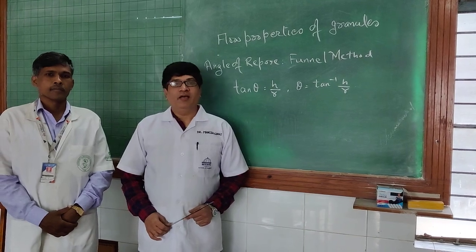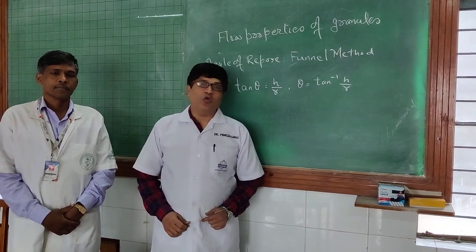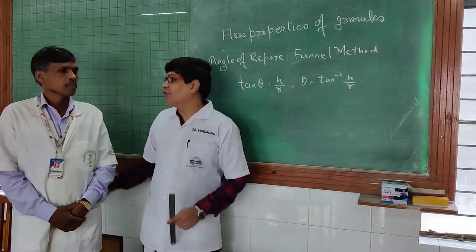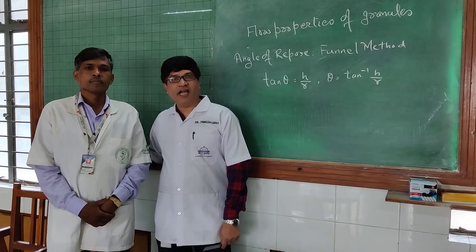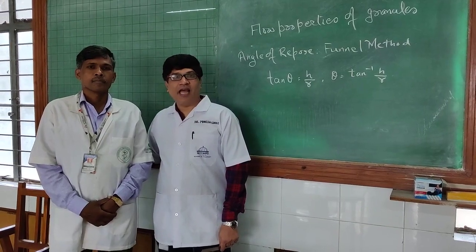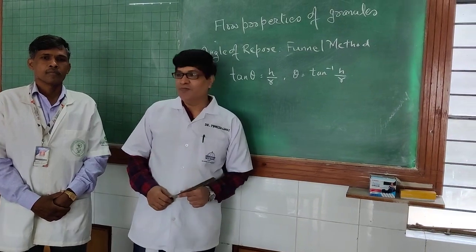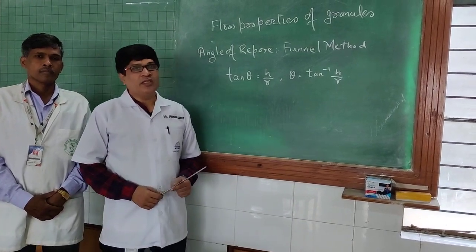Good morning everybody. Today we are going to study how to calculate angle of repose using the funnel method. We have with us today Rajendra Gaikwad sir, who is the lab assistant over here, and on the camera we have Syed. Okay.